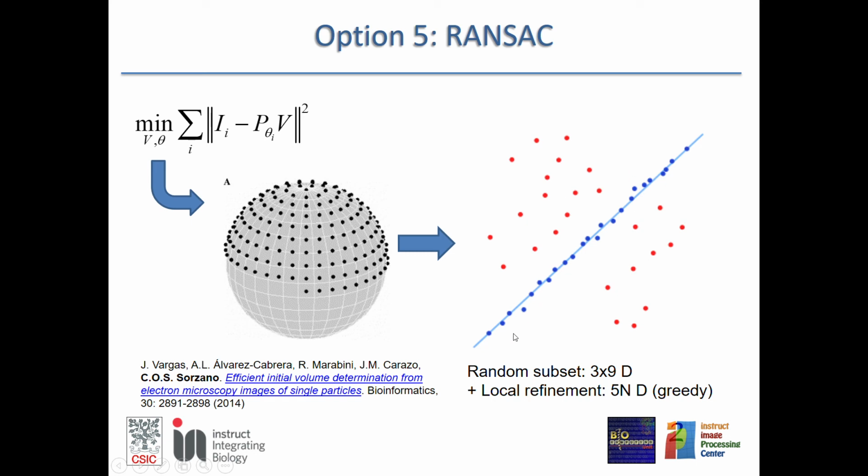But if you identify how many are more or less consistent with each other, and you make a 3D reconstruction out of those, the 3D reconstruction would be the model. The model here in this plot is the line. Then you might find volumes that are slightly better than the rest, and then you let those volumes drive the process. And it is successful in many situations. In some others, it is not.